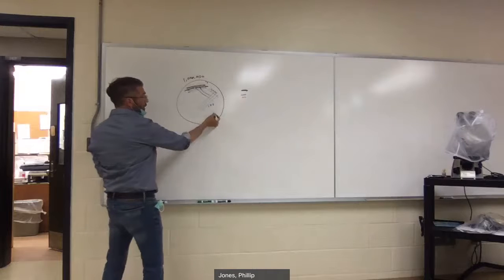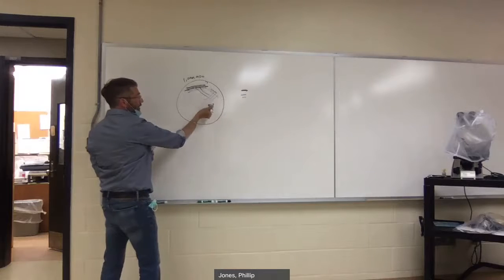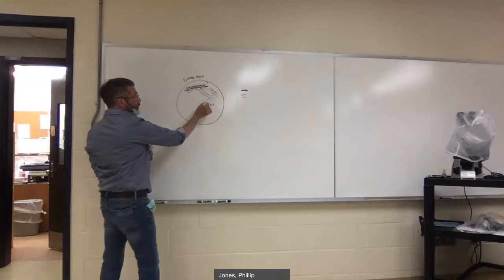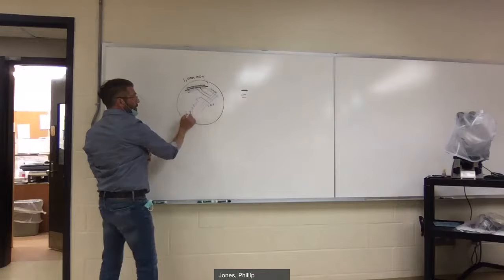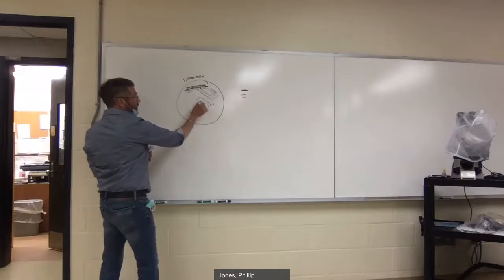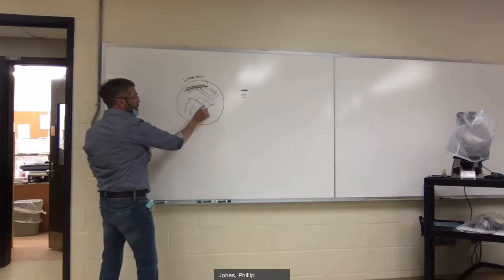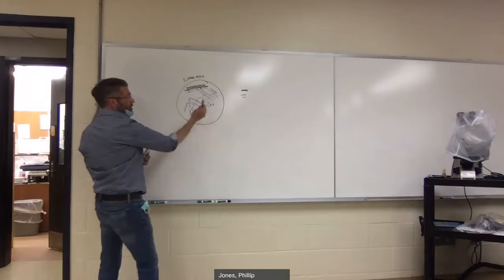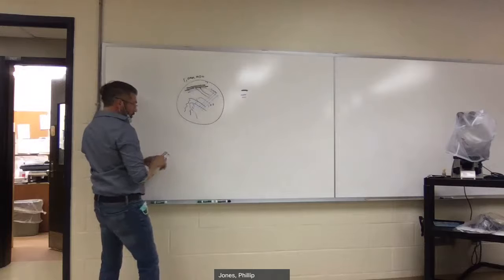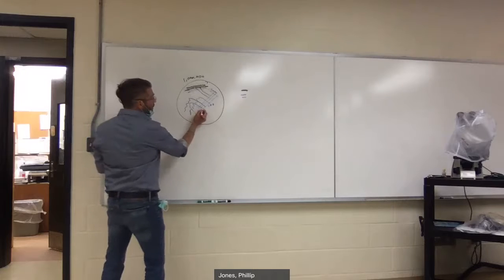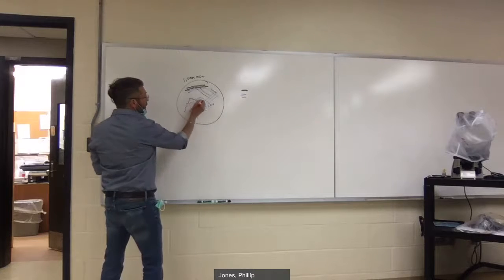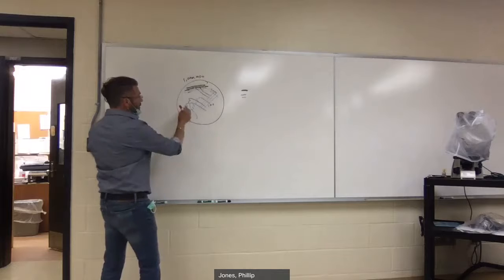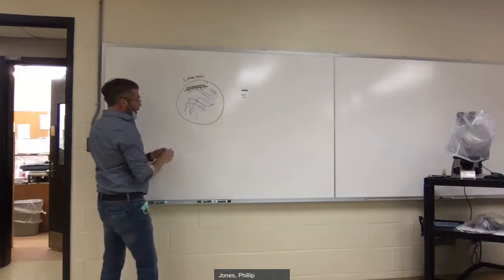Sterilize it again, cool it. I'm going to streak through my final swipe. I'm going to drag it through all 3. I'm going to kind of do this, we're going to do it again. Drag it through here, just kind of do this. Drag it through here and do this. So theoretically, it was sterile, I drag it through there. So hopefully, I will have 1 bacterium of each type somewhere on here.